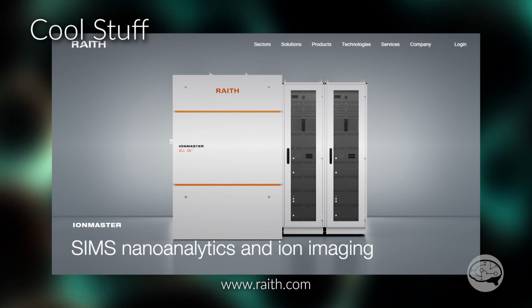But this year they introduced the Ion Master microscope, which uses ions not only for fabrication, but also for imaging. The interview I did with them was also kind of wacky, especially when I kind of insulted the original helium ion microscope from years past that was made by a different company. And one of the guys I was interviewing had actually worked on it. So I looked kind of like a huge jerk. I'll probably edit that out of the interview. Anyway, the Ion Master looks like some really fascinating new technology.